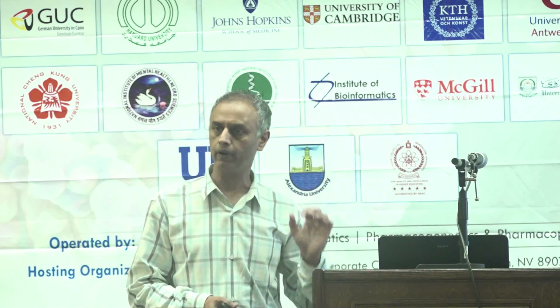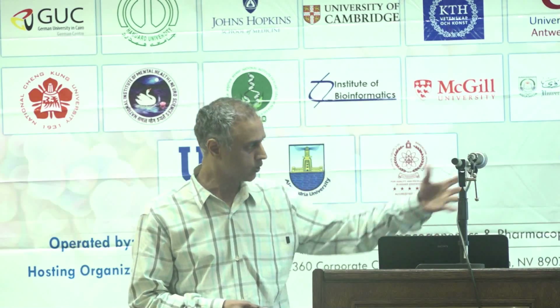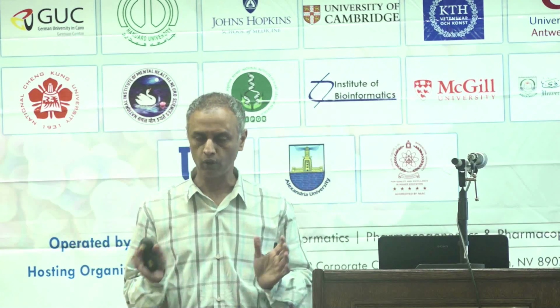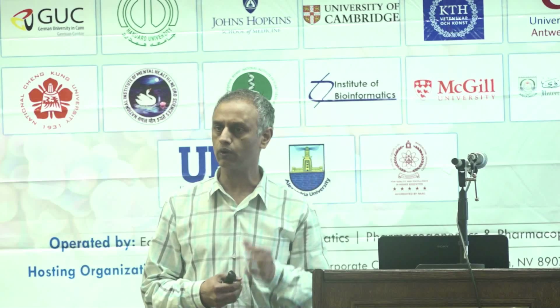One is it's cheaper. It is not using the kind of fancy technology that I'll talk about. So for $200,000 or so, you can get these machines, whereas the mass spectrometers we use cost $1 million today. Not to say that those costs won't come down. But the other is, it's not so much in the actual running of the samples, but it's in the way the results are presented to the clinician.